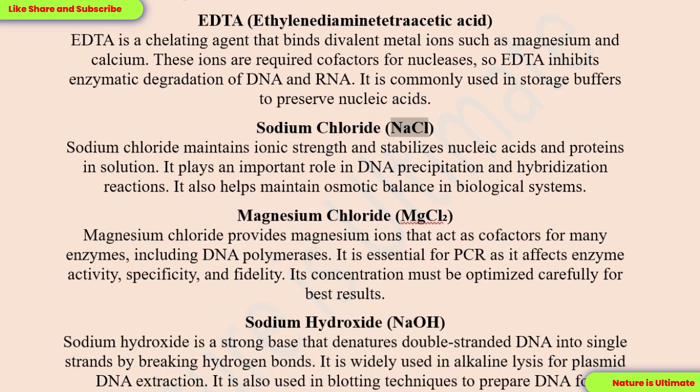Sodium chloride, NaCl. Sodium chloride maintains ionic strength and stabilizes nucleic acids and proteins in solution. It plays an important role in DNA precipitation and hybridization reactions. It also helps maintain osmotic balance in biological systems.